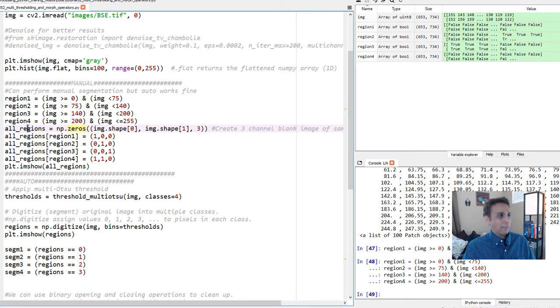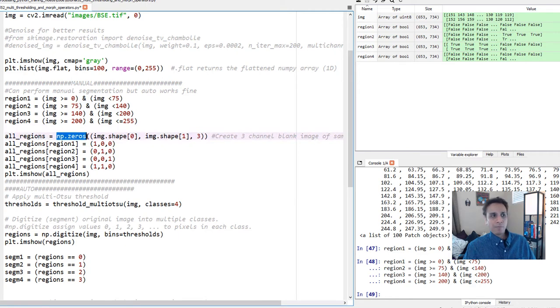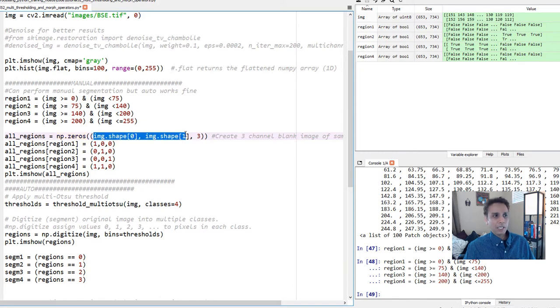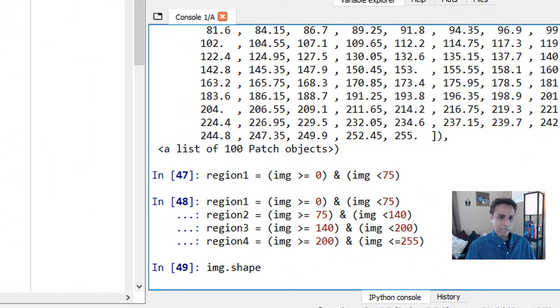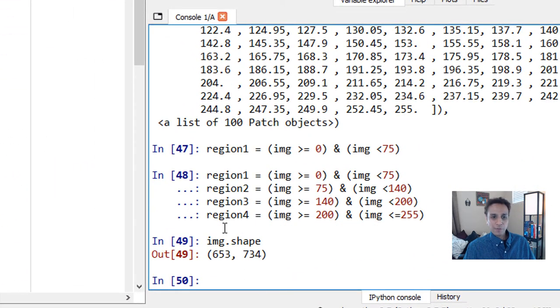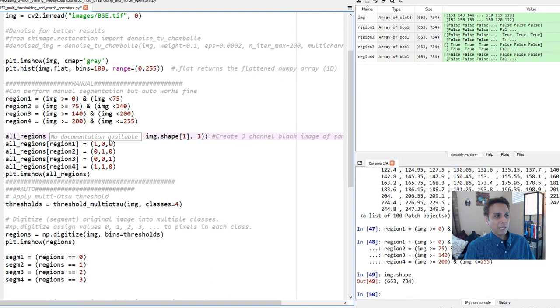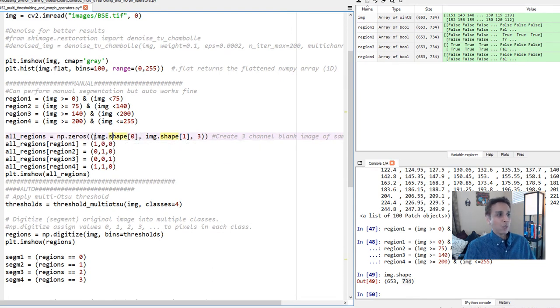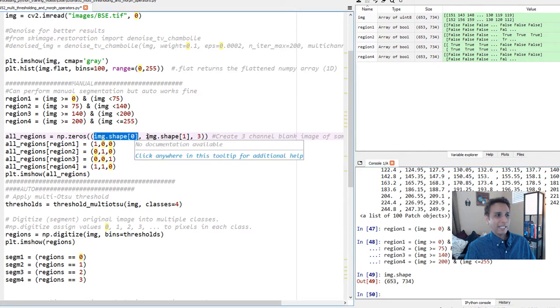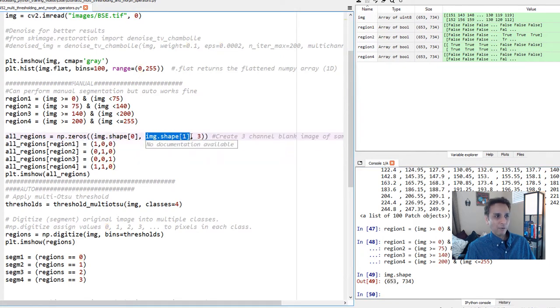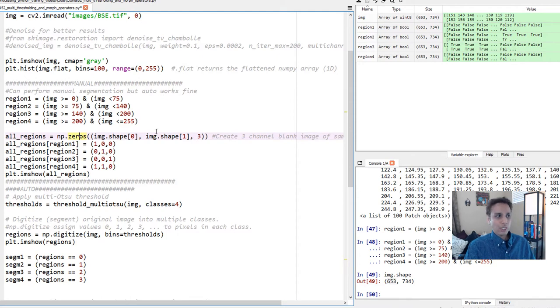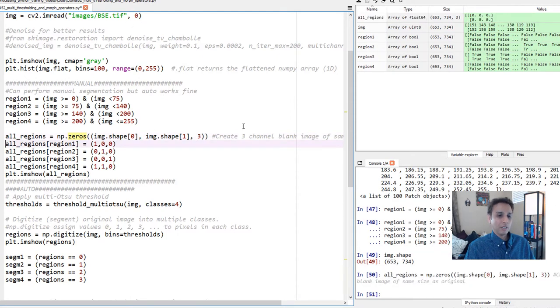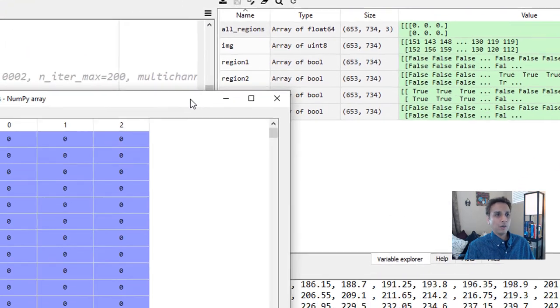I am now creating an array called all_regions, which is nothing but a bunch of zeros into the shape of my image. Image shape 0, image shape 1. By the way, if you want what is image shape, let's do img.shape. The shape of our image is 653 and 734. That's exactly what I'm doing here. My shape of the image - instead of typing 653, I just did this because my input image may change. So look at the shape of my image and the 0th dimension, which is 653, is the value that goes in here. And then the value that goes in here is 734 and three channel image.